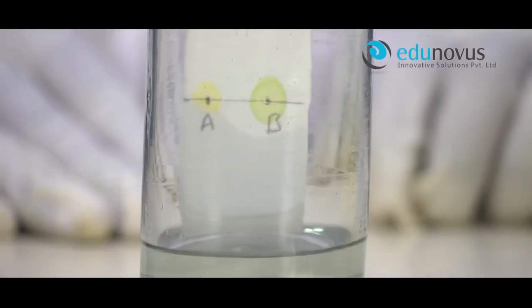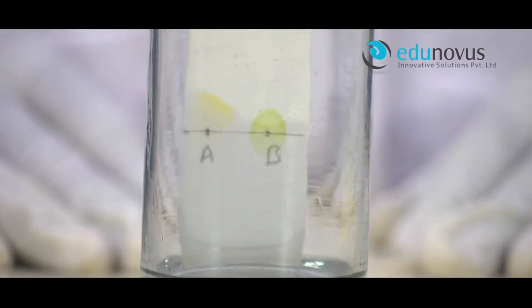Cover the jar with a rubber cork and keep it undisturbed. Notice the rising solvent along with the flower and leaf extract.